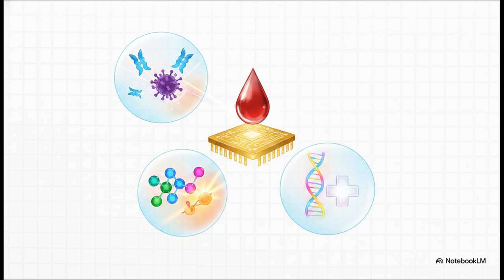SPR is used heavily in biotechnology facilities worldwide. It's an absolutely critical tool for developing new vaccines and characterizing exactly how well our antibodies fight off viral threats. Major pharmaceutical companies rely on it to discover how new drugs interact with target cells.